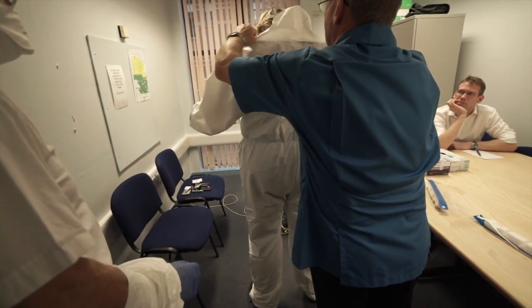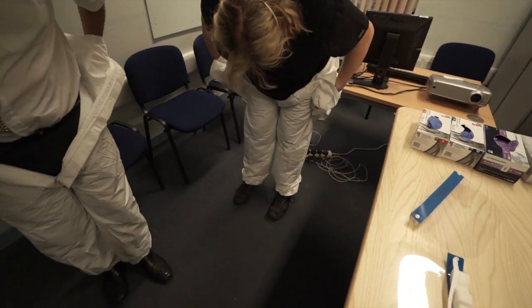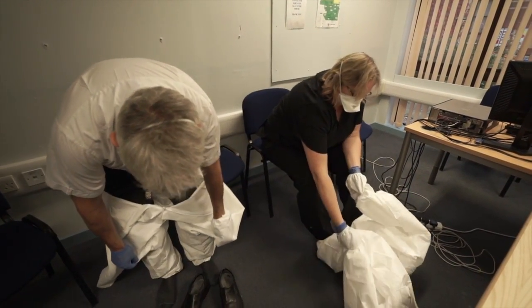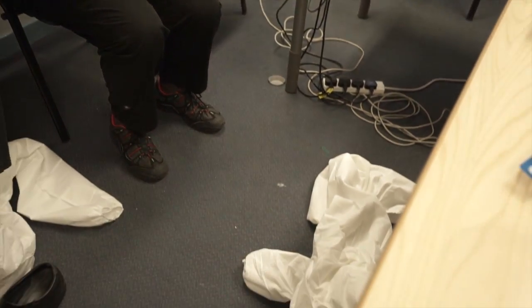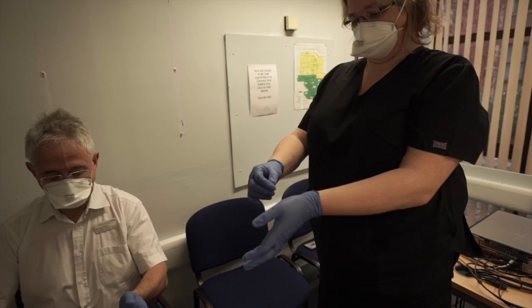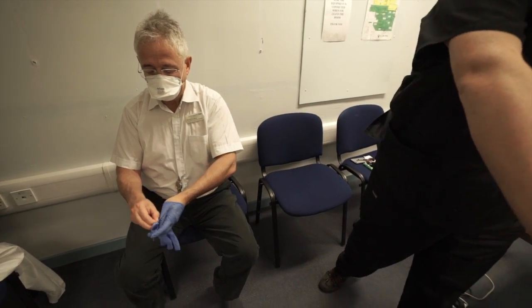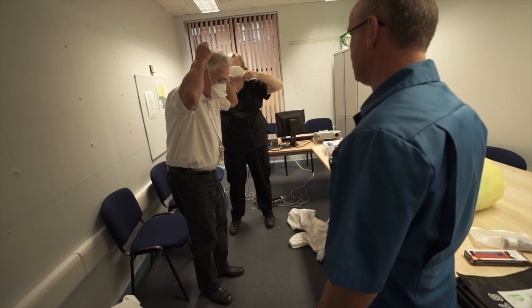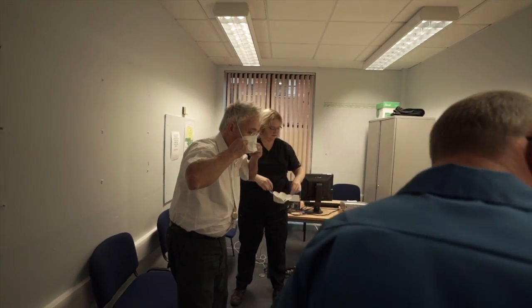Let me just ease it off your shoulder. That's fabulous, thank you. That's clinical waste, but you've got to take it off yourself. And the next thing I'm going to ask you to do is carry out hand hygiene. And again, that's clinical waste.